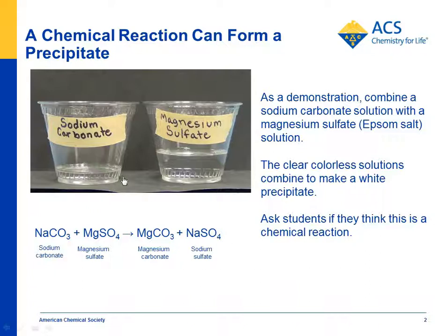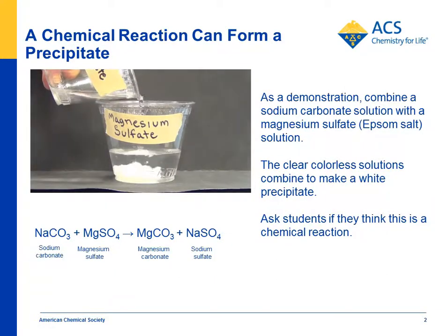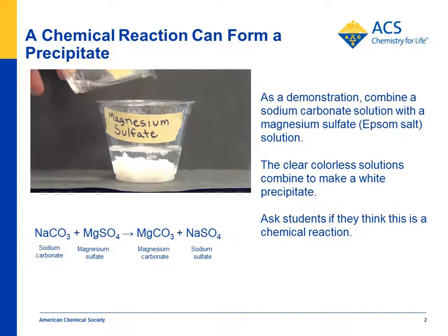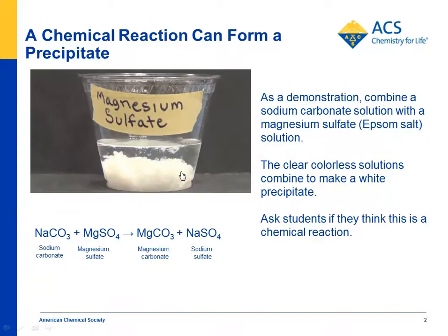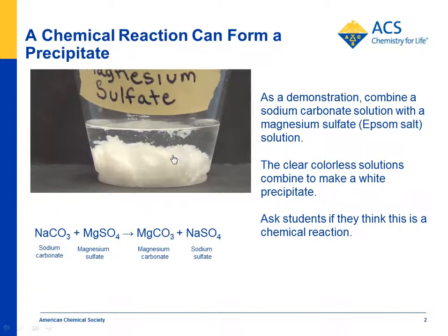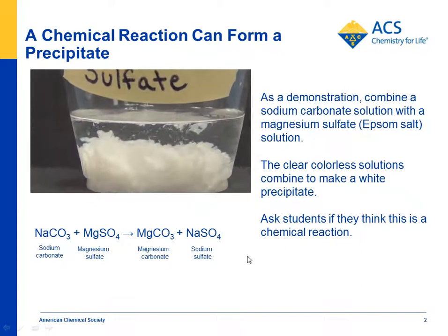As a demonstration, you can combine a sodium carbonate solution with a magnesium sulfate solution and see what happens. Students will see that these are clear colorless solutions. You can tell them what you used to make them and show that a precipitate or solid forms. You could stir it up and show students that it won't dissolve.